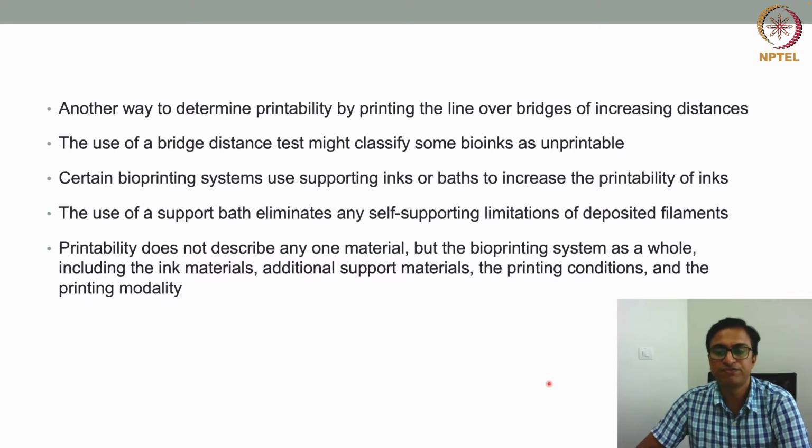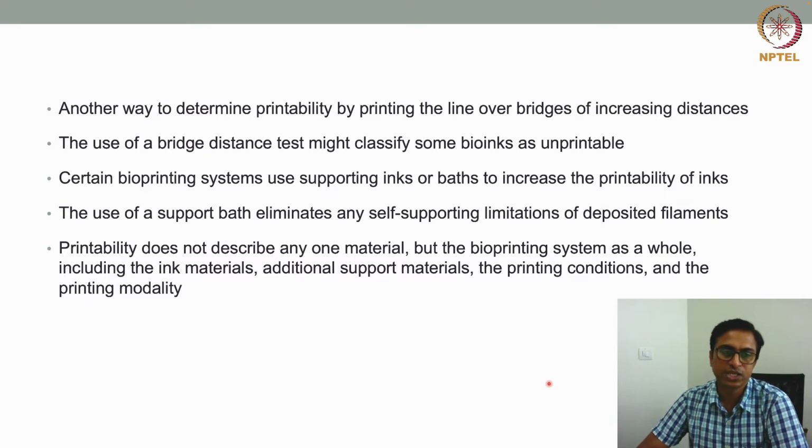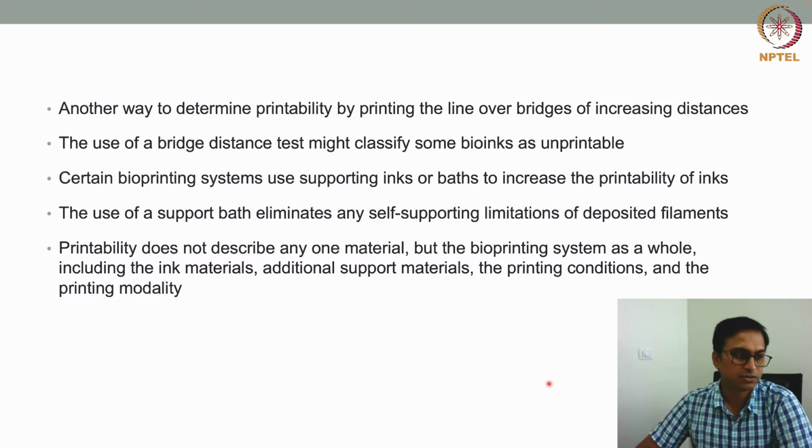Print fidelity would be very good in this case. A bioink that otherwise can be classified as unprintable in conventional bioprinting without a support bath can be classified as printable in a support bath.